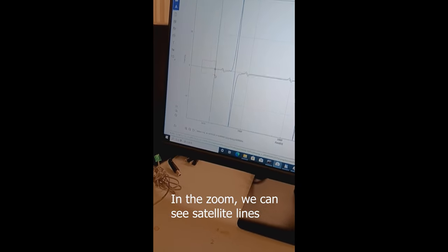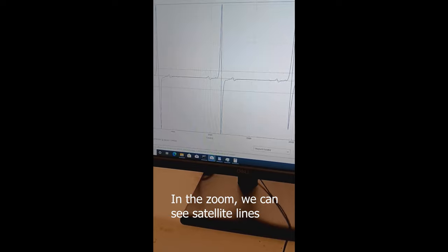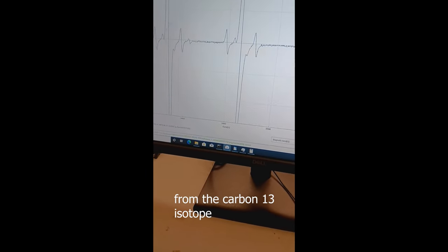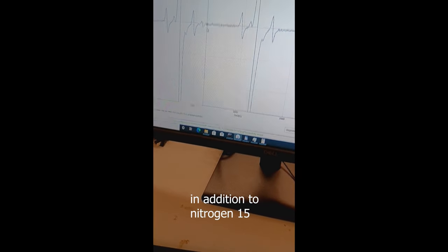In the zoom, we can see satellite lines from the carbon-13 isotope in addition to nitrogen-15. Here is the spectrum from nitrogen-14.